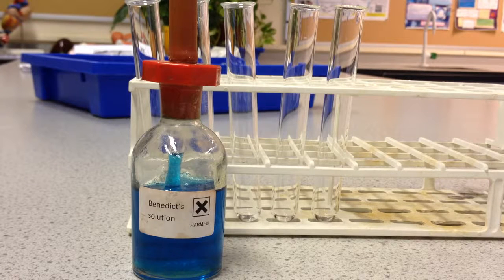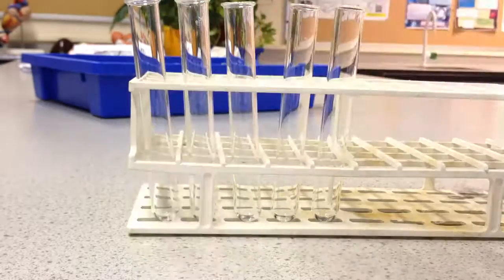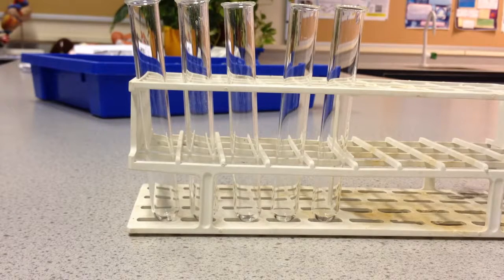Okay, so we are going to talk about the Benedict's test to test for reducing sugars. Let's just start with how we do the test for the reducing sugar itself.